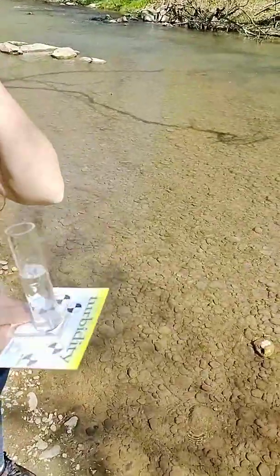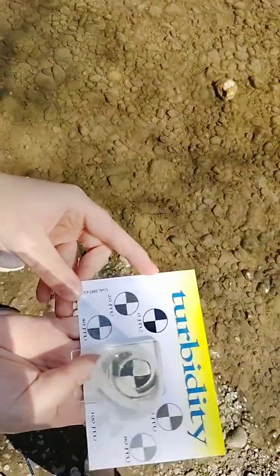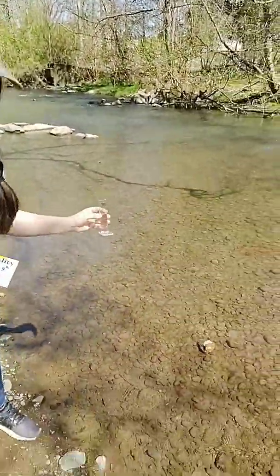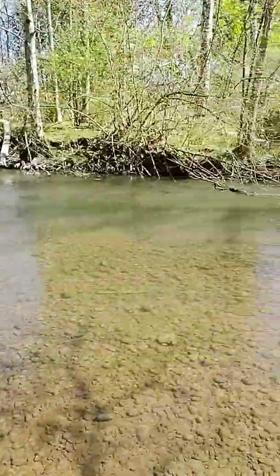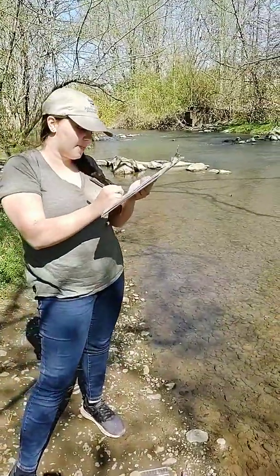Yeah, so I think the turbidity is actually very, very clear. I would almost say 0, maybe 5. There's a little bit of particles in there, but it's not very faded at all. So it's very clear water today. And since we didn't use chemicals for this one, I can put the water back in the creek. All right, so I will write down our score there, which I'll just say was around 5.